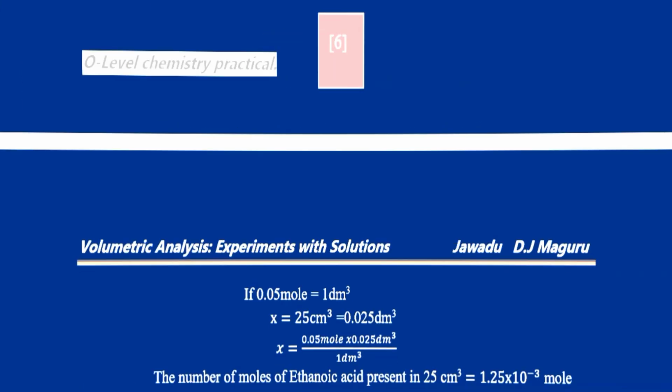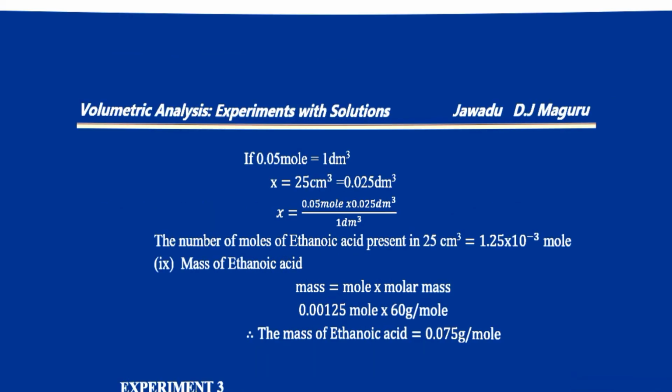So according to our experiment and the questions, now we end up here. We will see another experiment, experiment number 3, another time.